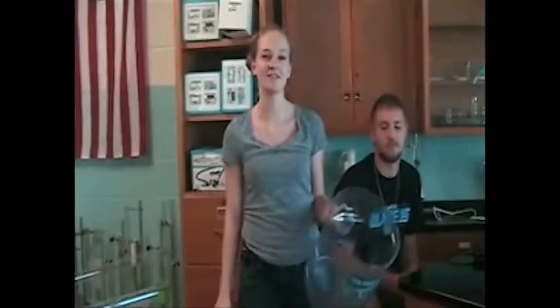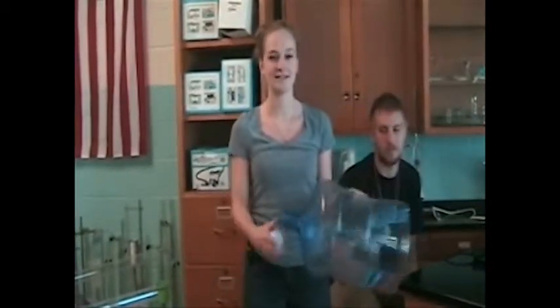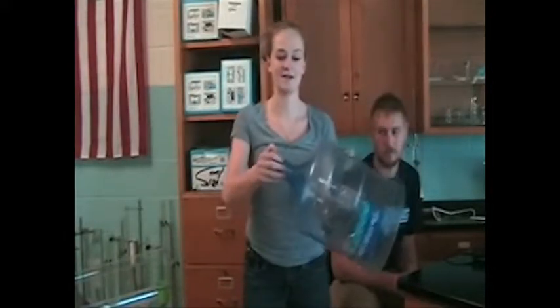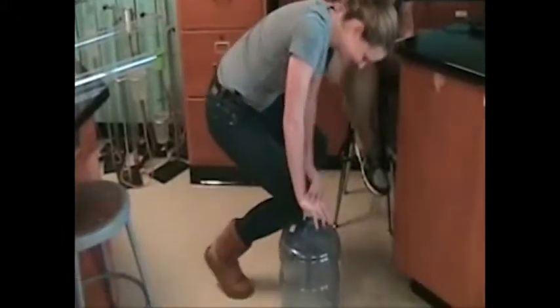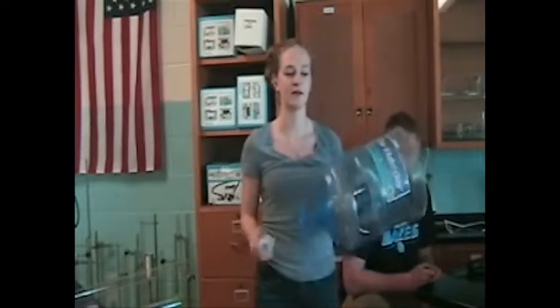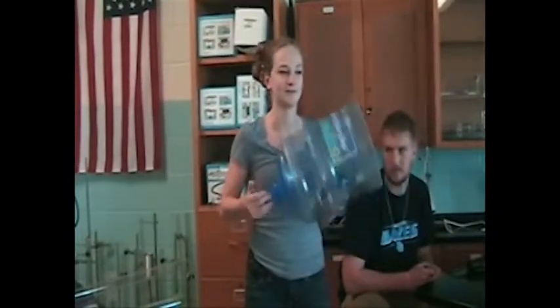Okay, hi, I'm Courtney Vidovich, and this is the first step in making our bioreactor. This is a 5-gallon jug we're putting algae in, and it needs to be watertight because we're putting it upside down. So we're putting these snaps on, and you just snap it on. And then if you can pull it off, it's not tight enough, so you can see it's tight enough. These water caps were made by the water company, which is why they're a perfect fit.